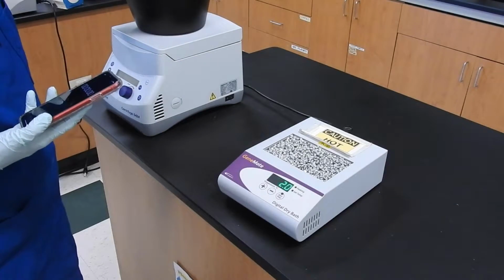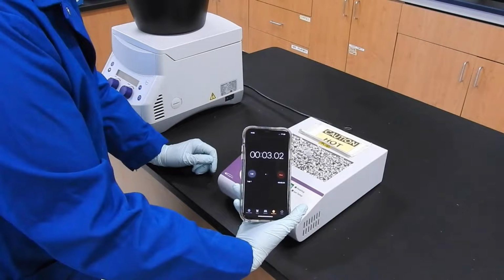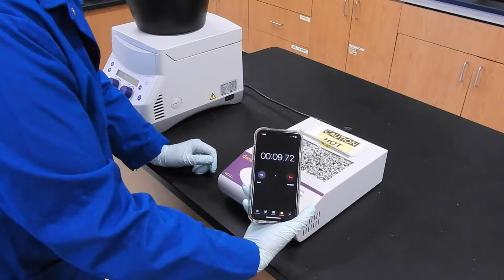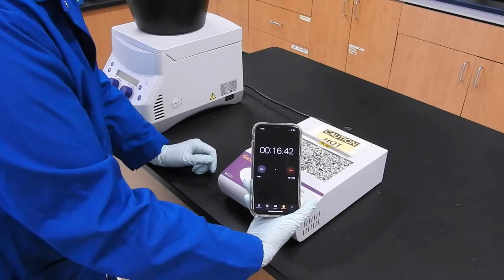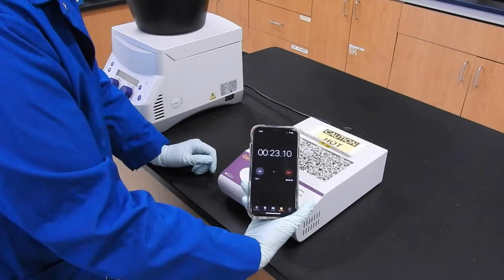I carry the ice bucket with the cells to the heat block set to 42 degrees Celsius and place the tube in the beads and start my timer. This heat allows the plasmid DNA to enter the bacteria cells. After 30 seconds, I'll remove the tube from the beads and place it back on ice. Then I'll return to my bench.